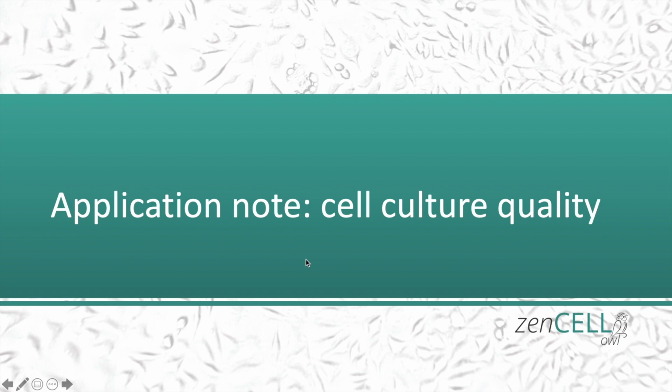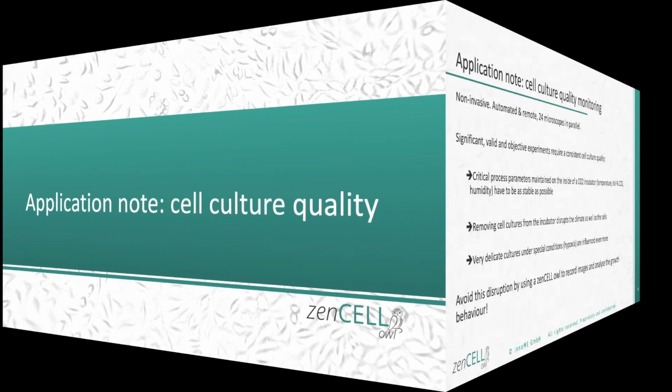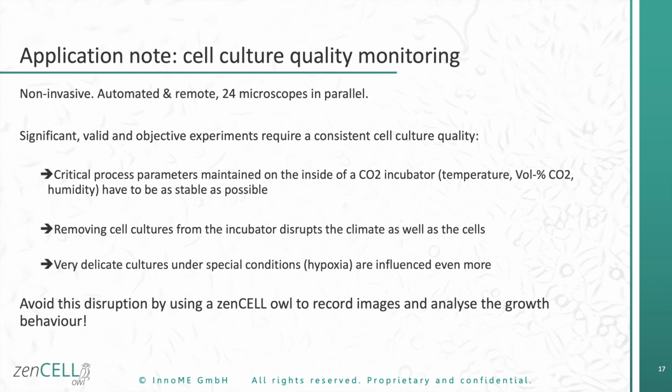Application note: cell culture quality. Cell culture quality monitoring is very important to achieve reproducible results and experiments.